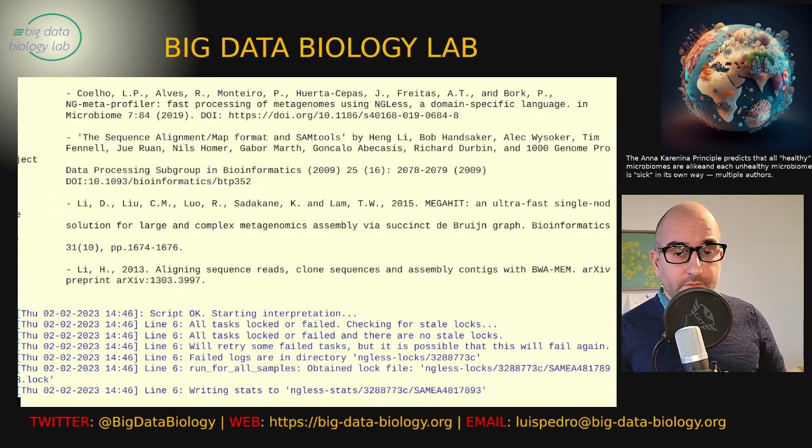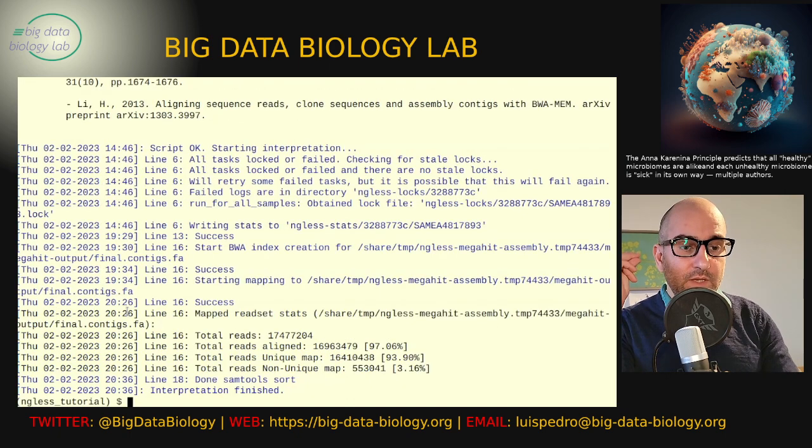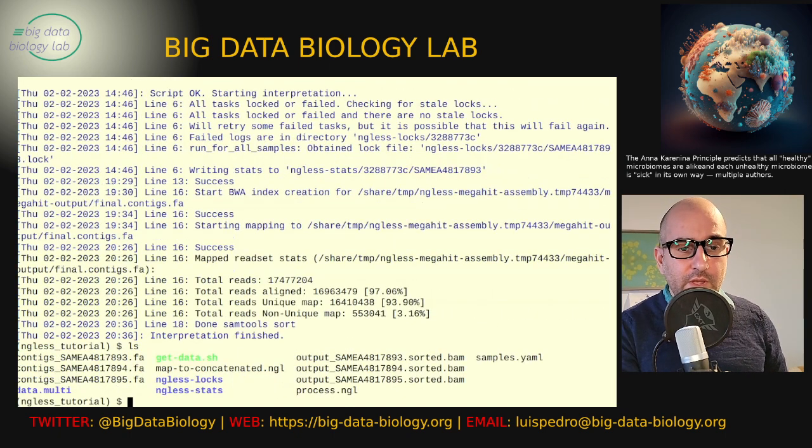You could be using a compute cluster where you run these three in parallel, or you could run two in parallel and one later. And if you had 3,000, you could run 500 in parallel. All of this works well, and everything works as you'd expect. This is running, so let's do the magic trick of jumping to the future. Now you see that everything has run three times.